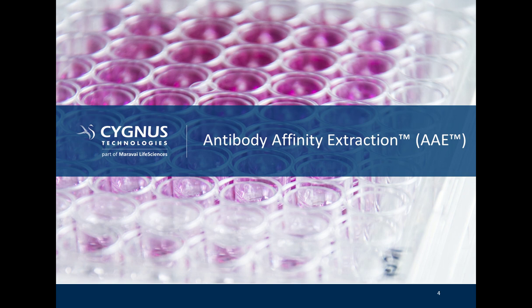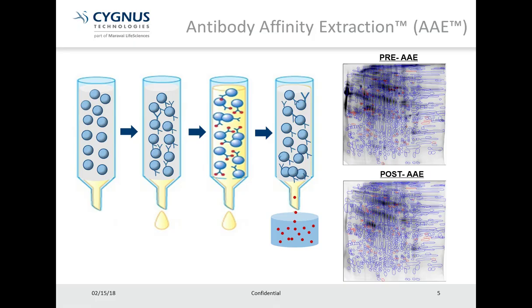So next we'll spend just a minute discussing antibody affinity extraction. As I mentioned in the intro, AAE was launched in 2014 as a method that was much more predictive of how antibodies would perform in an HCP ELISA than a 2D Western blot. This diagram is an illustration of how AAE works in a nutshell.